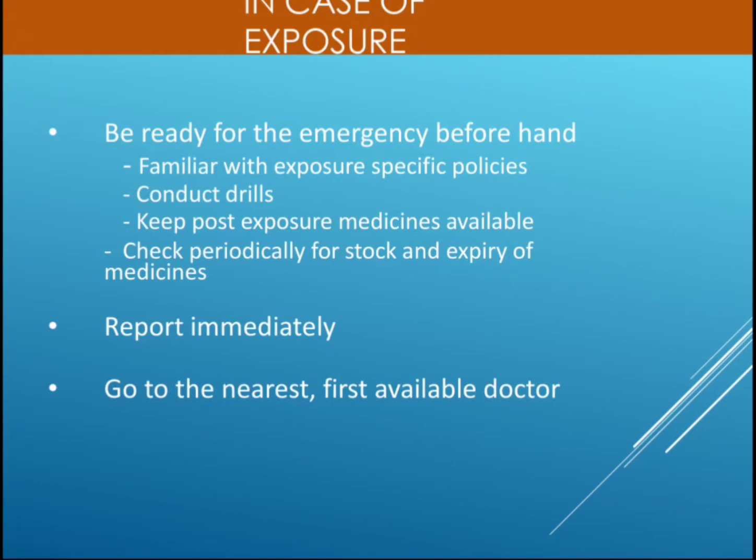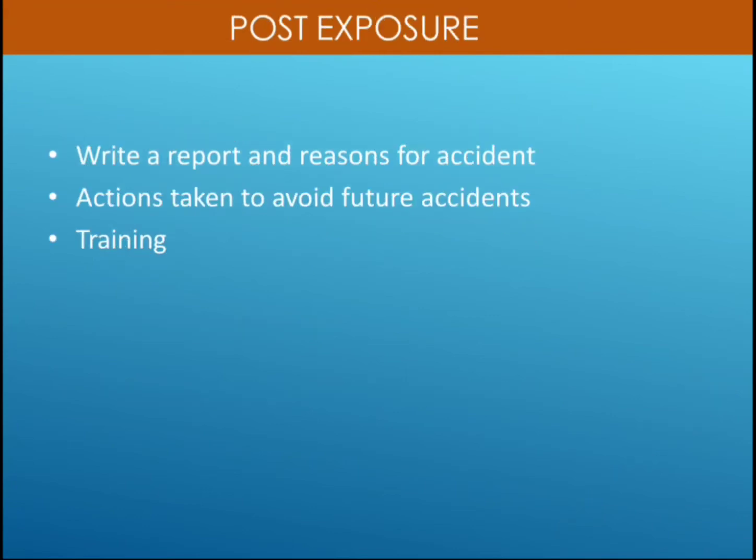Those stocks of the medicines which are there for safety, whenever you are exposed to that particular pathogen, should be of current expiry only. Okay, it should not be expired. We have to report immediately if there is exposure to that pathogen or any other risk. Then we have to go to the nearest first available doctor.